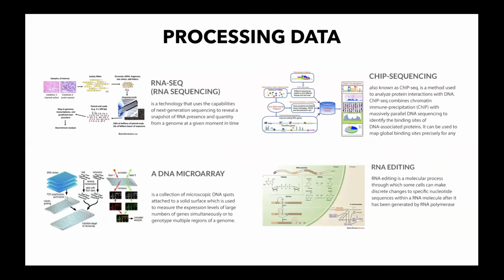In each one of these cases, you will have a different approach to process that data in order to structure the data. For example, in RNA sequencing, it's really the alignment of the reads to the genome and quantification of the aligned reads to genes or isoforms. In DNA microarray, for example, we can look at how we spot the changes in individual positions, and that will be called variant calling, and that could be done with Illumina next-generation sequencing or microarray data.